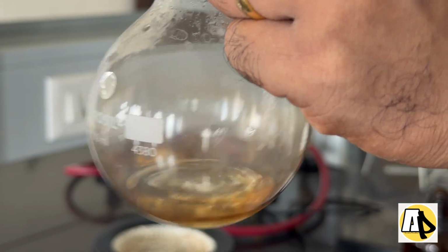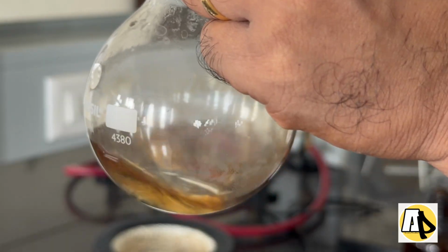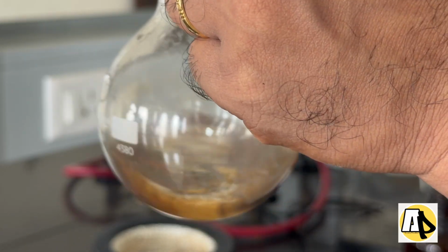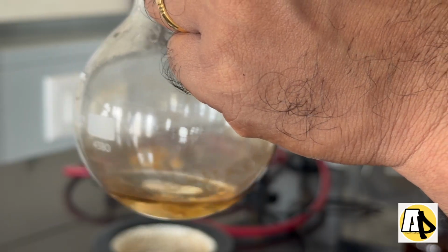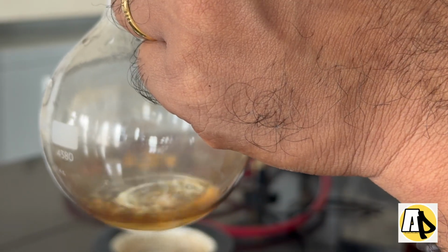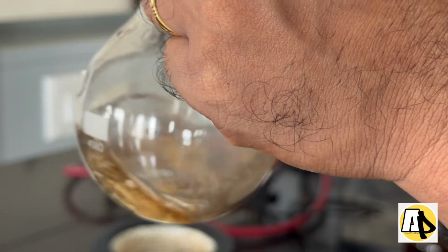You can see I am not rushing, I am just adding dropwise only with continuous shaking. You can see the cloudy precipitate already forming. So once all the solution is formed into cloudy precipitate, then I will stop it.